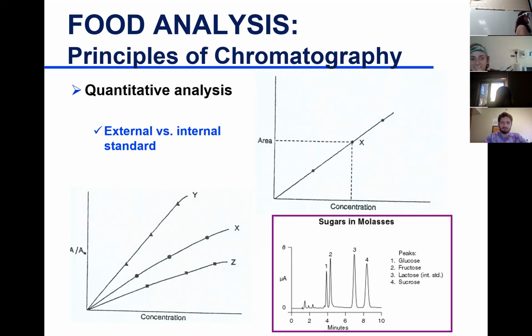So again, the internal standard is used to correct for sample error, sample preparation error, especially when you have sample preparation, same as the GC sample preparation, with a lot of steps and a lot of places where you can lose samples when you are determining FAME, or fatty acid methyl esters. So there are a lot of steps that get you to that FAME, to the GC analysis. So if we have an internal standard, we can correct for these errors and have more accurate results, basically.